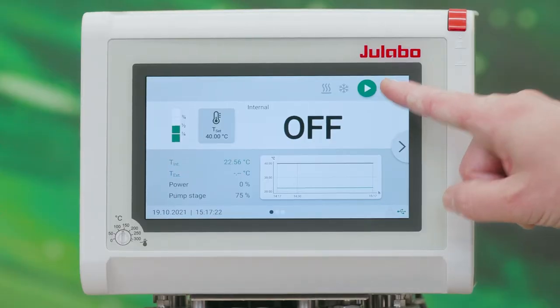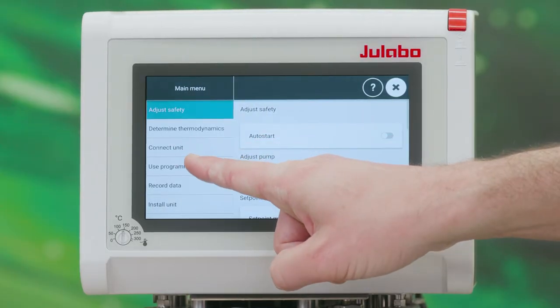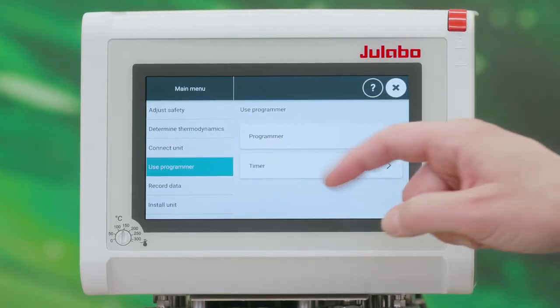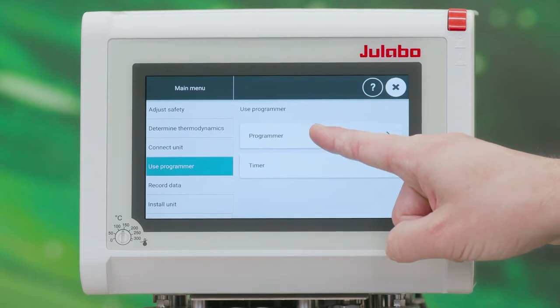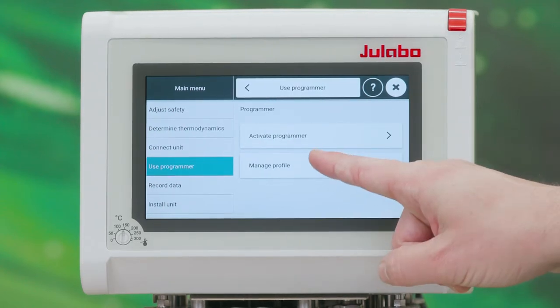You can find the Programmer in the submenu Use Programmer. To manage temperature profiles, simply tap on Programmer and then Manage Profile.